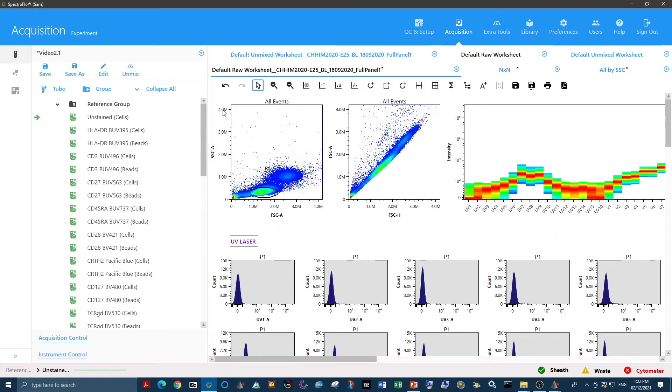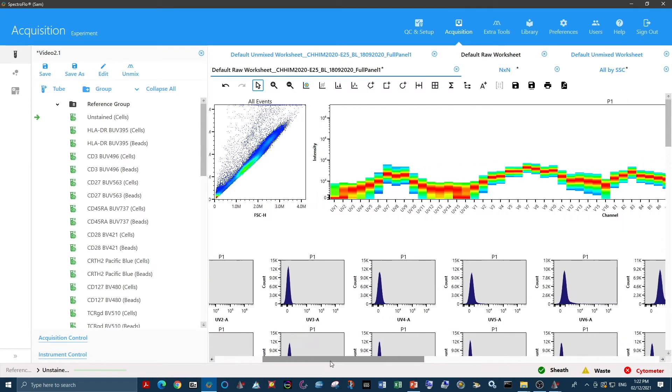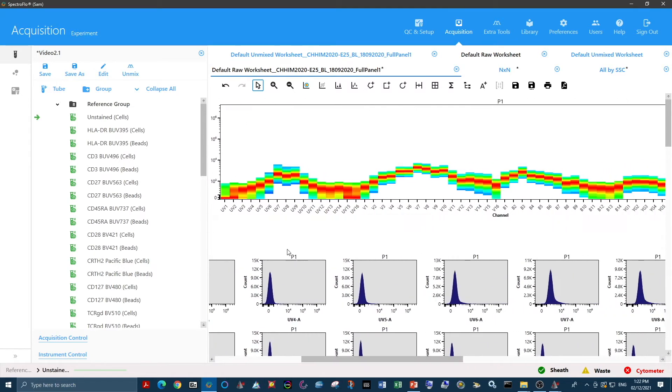The data that we've been working with in the previous videos is a good example of homogeneous autofluorescence. This panel is only interested in T-cells, and all lymphocytes have the same autofluorescence spectral signature, as we can see by this very nicely defined single signature here in the spectral plot.